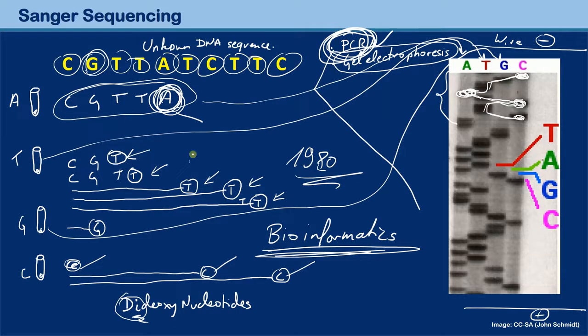And if you think this whole thing is kind of complex, then I would say the minimum, at least, is that you should know how to read off a gel like this, okay, to determine the base sequence. I mean, that is really the bare minimum, okay? And also know that you need PCR and gel electrophoresis for the Sanger sequencing, and you also need these special dideoxynucleotides which stop the copying of the DNA once they're built in, okay?